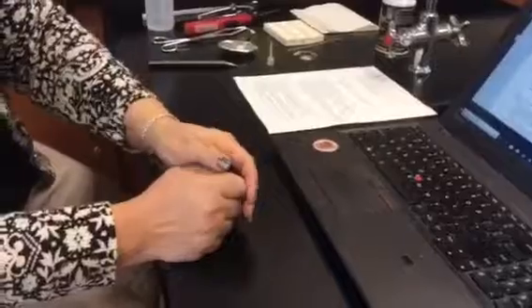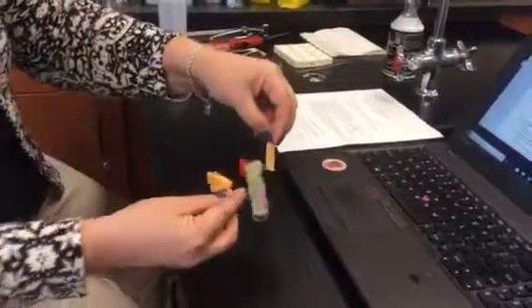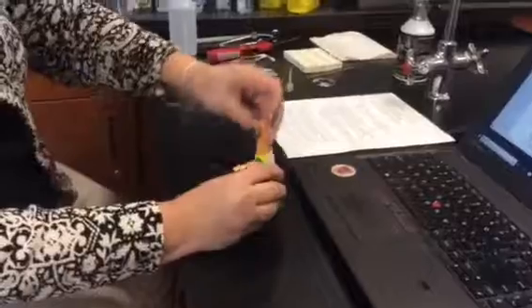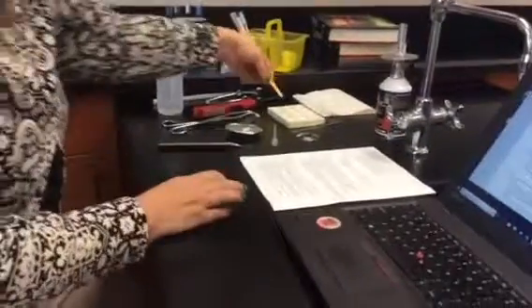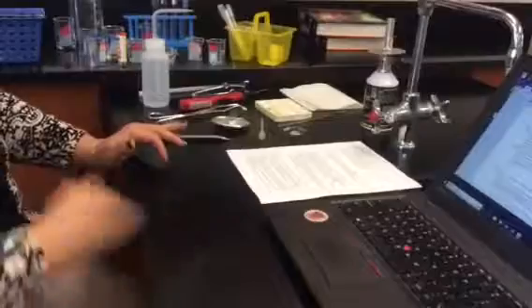And then it says take litmus paper, and this is your litmus paper. The lab, which I've already printed, says half a strip of red and half a strip of blue, but all you have is red. So you're going to take one of these pieces off, and then lay this in the well like this, and immediately you should see a color change. Not a super great one, but you should see it. It should either get redder or it should get bluer.